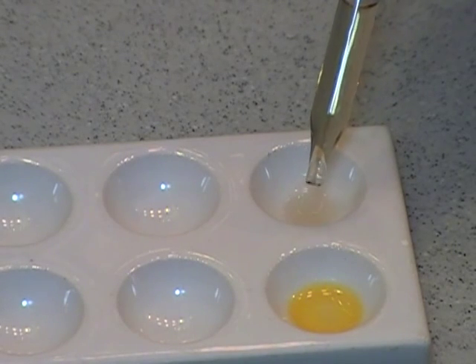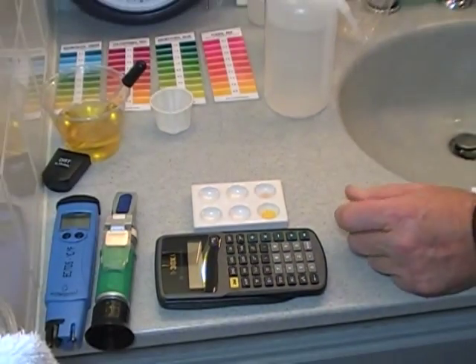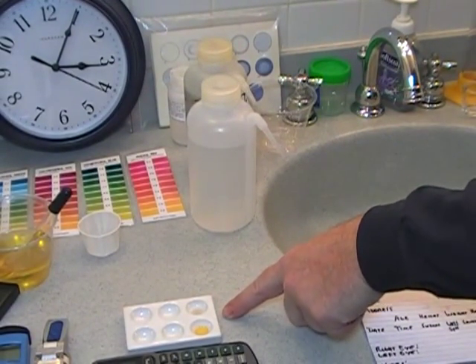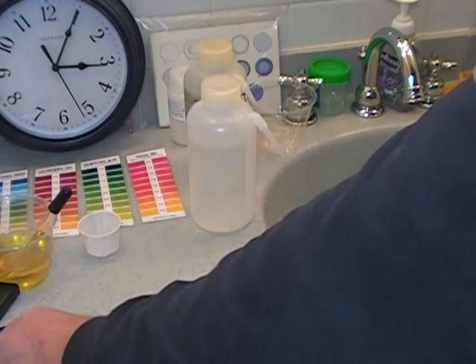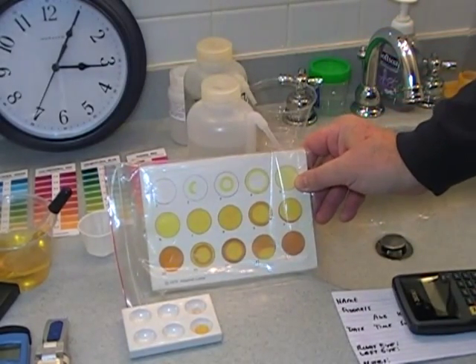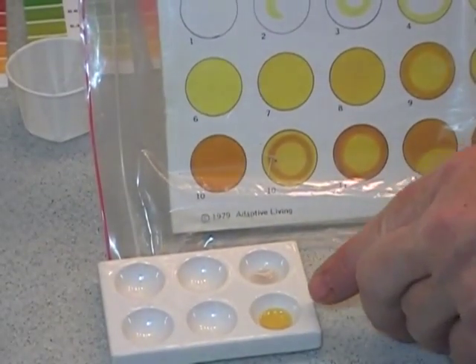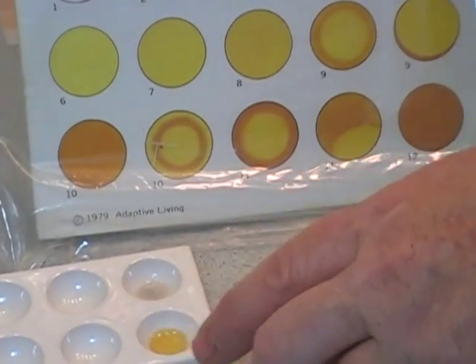Drop them and let it roll down the side at twelve, three, six, and nine o'clock. It is five minutes after; we need to look at this reading at about ten after. In the meantime, we will read the ammoniacal nitrogen. It is clearly as dark as an eight, slightly forming a nine but not quite — about an eight-plus. You can call that an eight, but it is starting to form the outer ring there, though it's not quite dark enough to be a nine.